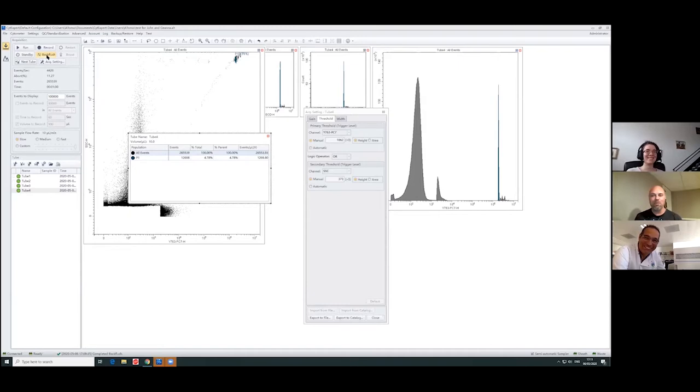They said, how do you calibrate? And we said, we have biological calibration particles that we'll be using, that are labeled with a known quantity of GFP. Oh, that's the added benefit of those mouse leukemia viruses, or the stuff that John Nolan has, is that you can add GFPs or a DsRed or some derivative to them, also in known quantities. I think the MLVs come with a superfolded EGFP, and I know John has membrane dyes that attach to the EVs that he generates.